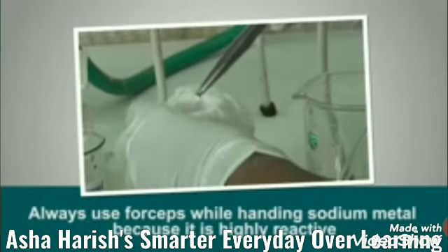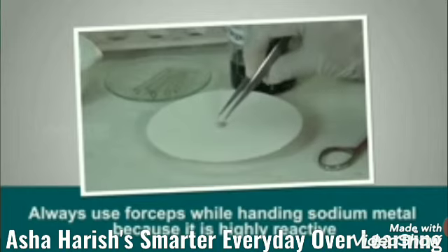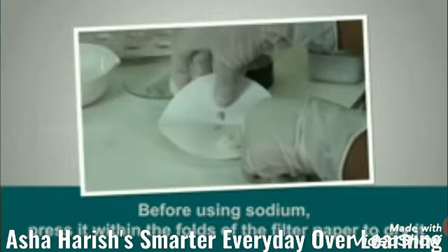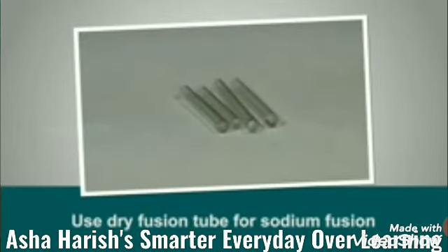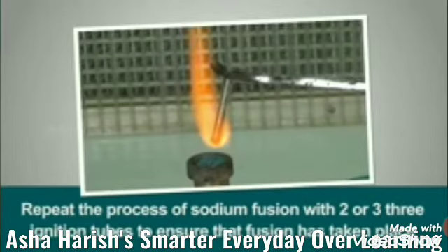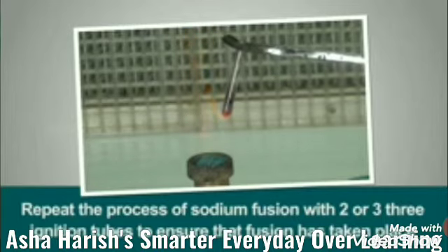Now what are the precautions? Always use forceps while handling the sodium metal because it is highly reactive. Before using sodium, press it within the folds of filter paper to dry it. Use a dry fusion tube for sodium fusion. Repeat this process of sodium fusion with 2 or 3 ignition tubes. Ensure the fusion has taken place.